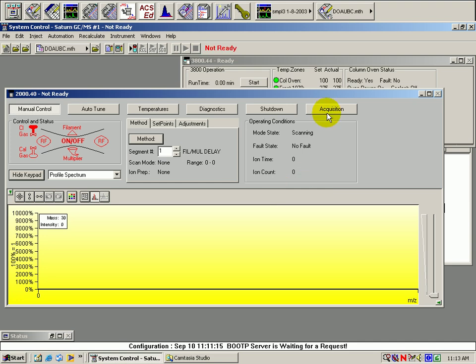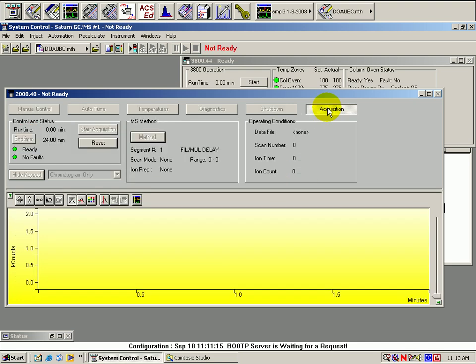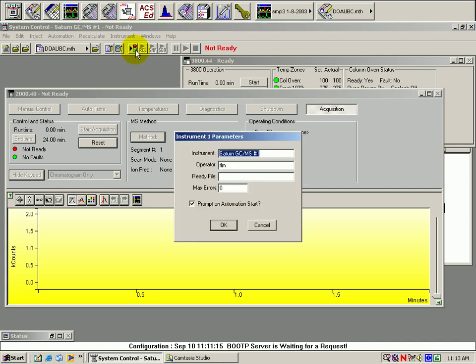First, toggle the mass spec into the acquisition mode. Then, to make a single injection, move your cursor to the sample file icon and click once.